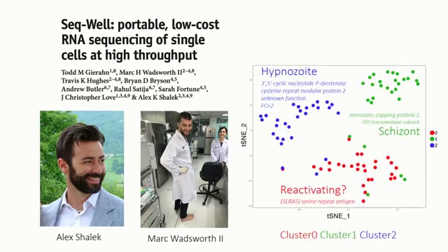This is very preliminary data. It's a proof of concept, so we still have a lot of work to be done. But we have already performed the first pilot experiment where we could generate 84 transcriptomes of individual P. vivax parasites. Using a t-SNE analysis, we obtained three clusters.